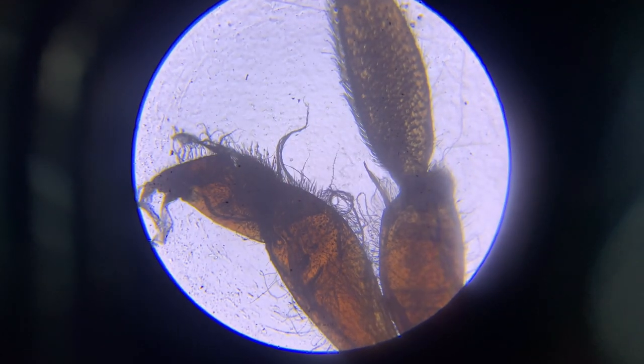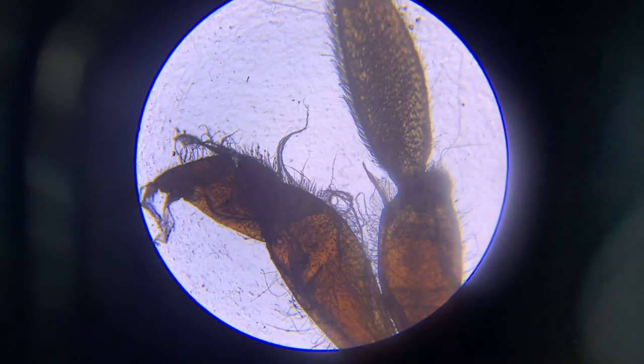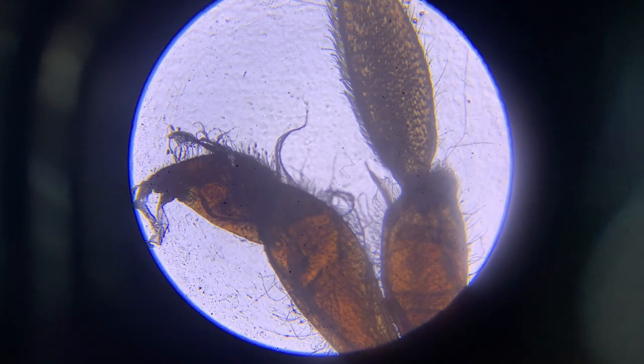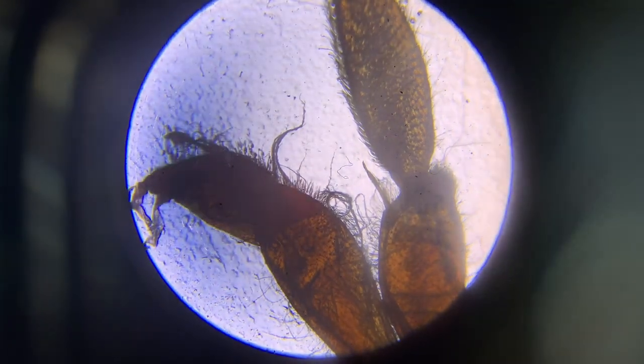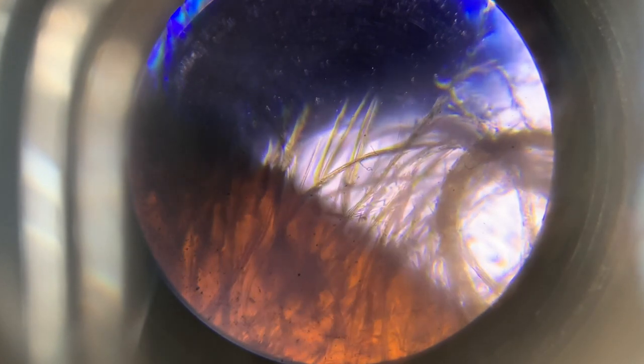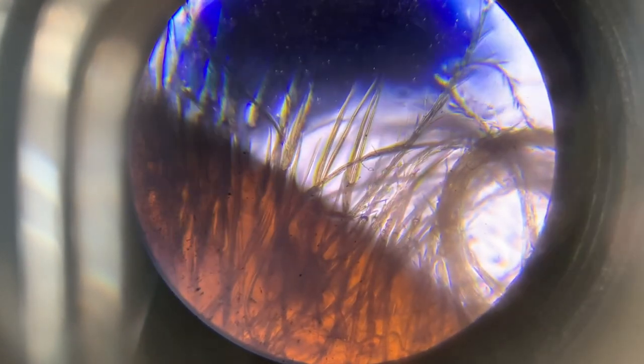This is a bee's leg at 40x magnification. Taking a camera video through the microscope doesn't do it justice, but that is at 40x. This next clip is a part of the bee's leg at 100x magnification, and then there's a final clip at 400x magnification — it's really hard to get focused in well at that high a magnification. You have to focus in and out on different parts, and it will go all the way up to 1000x but this is just 400x.